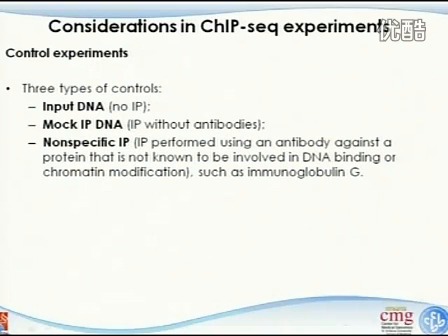And the next consideration I want to mention a bit is the control sample selection. There's always a big debate whether you need to use a control for the ChIP-seq experiment or not. Of course, some groups favor using the control. We obviously need to do the control experiment, which most people will agree with if you don't have to pay for the bill. But we know that this type of control is really not very cheap, because you're sampling the entire human genome without any additional immunoprecipitation, and that has become a really, really expensive assay to do.